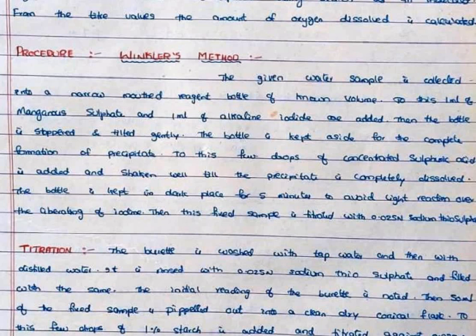The bottle is kept in a dark place for 5 minutes to avoid light reaction over the liberated iodine.